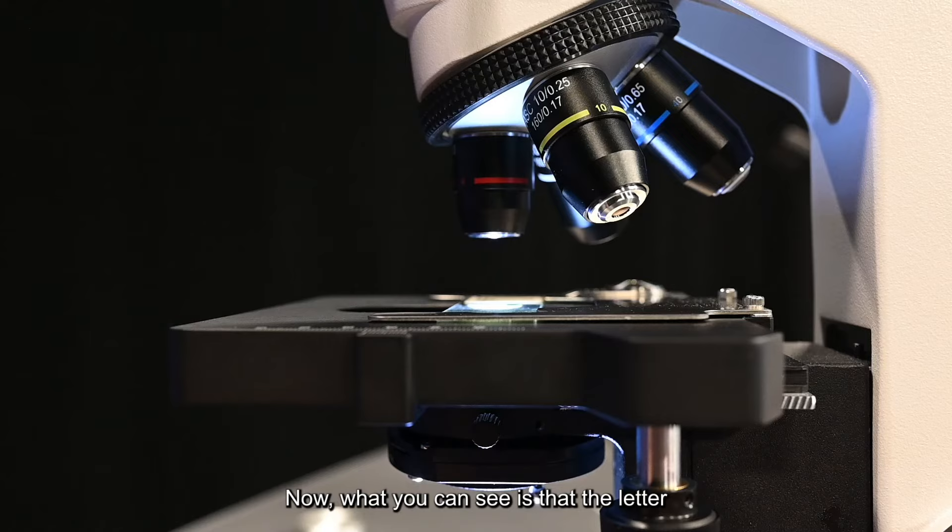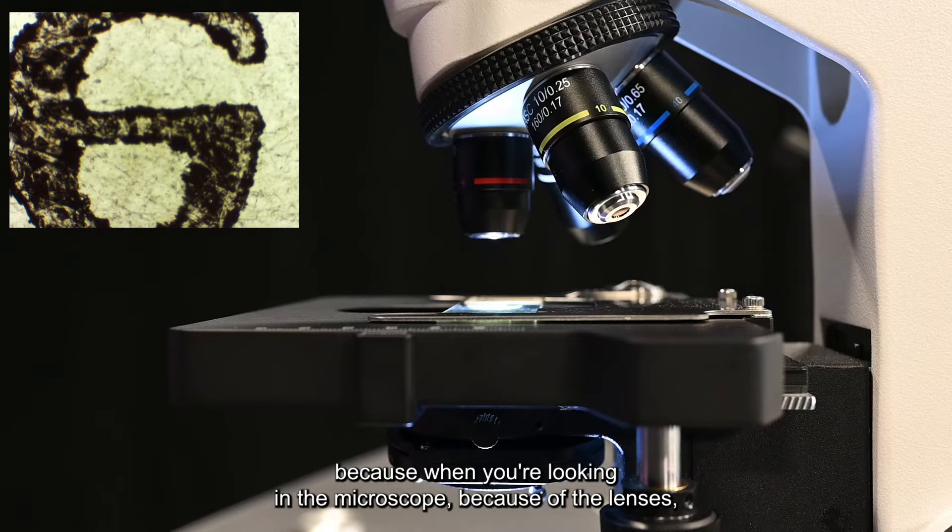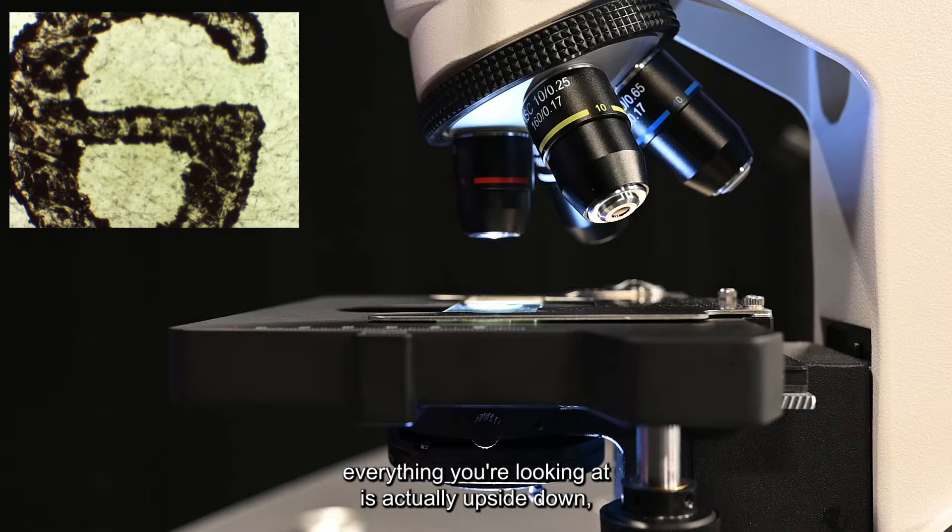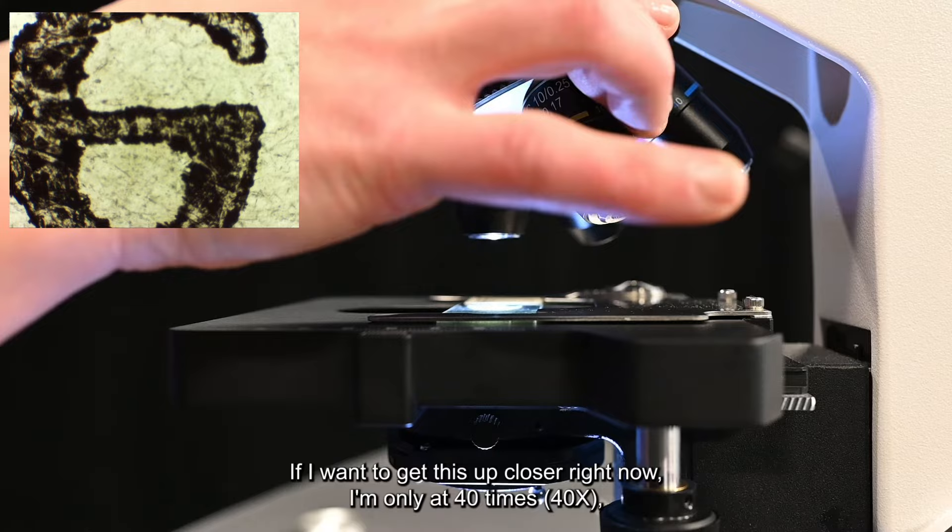Now what you can see is that the letter E looks flipped. It looks flipped because when you're looking in the microscope, because of the lenses, everything you're looking at is actually upside down, which is good to know when you're actually looking through slides to try to find different things when it comes to location and where you need to be going.